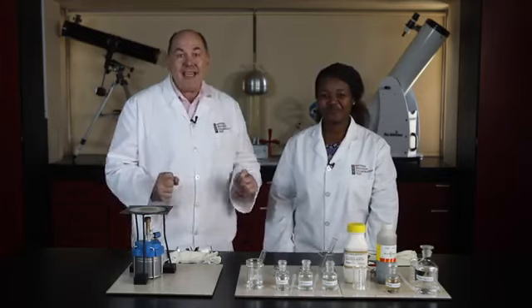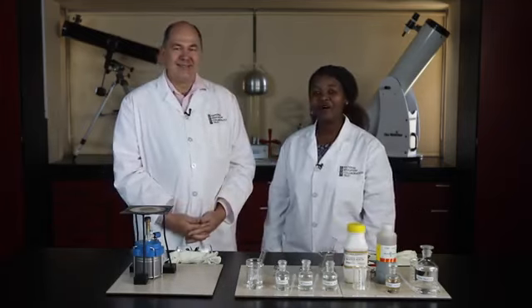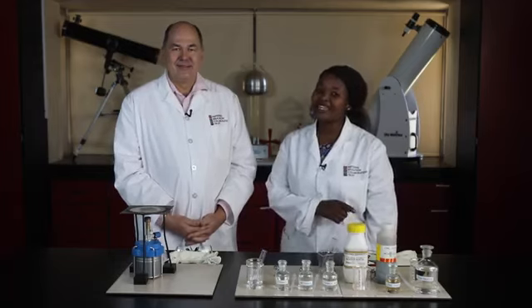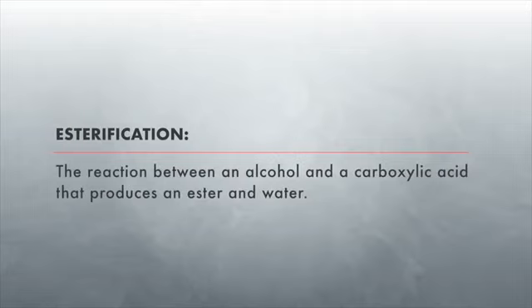Today we're putting organic chemistry into practice. We are making esters. Although you won't be able to smell these fragrant compounds, you will be able to see the process of making them in small quantities. The reaction between an alcohol and a carboxylic acid produces an ester and water. We call this type of reaction esterification.